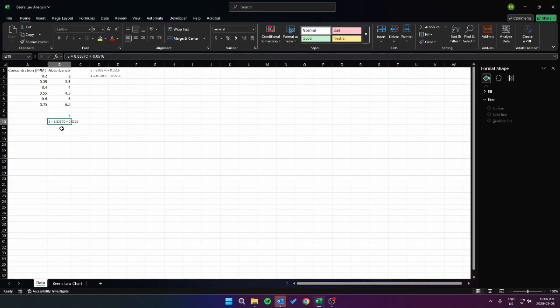If you were doing this by hand, first you would subtract 0.0516 from 5, and then divide by the 8.8387, and that would give us our C. So right here, I'm going to do just that.